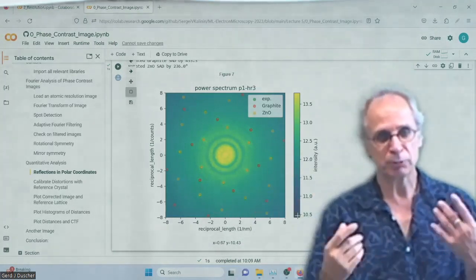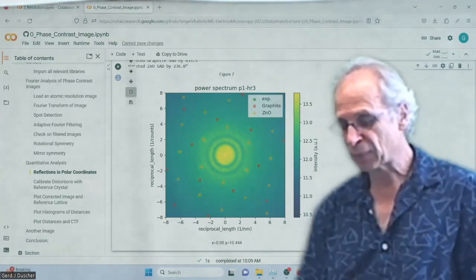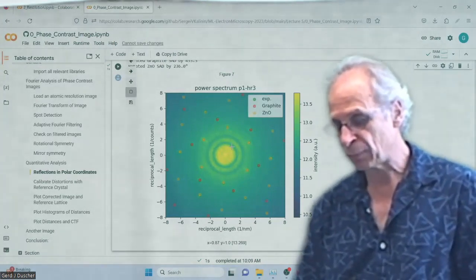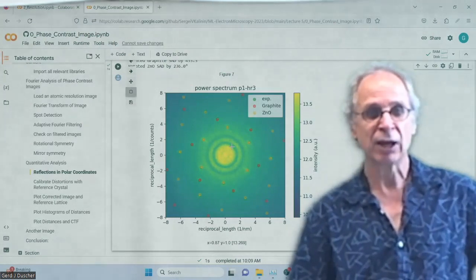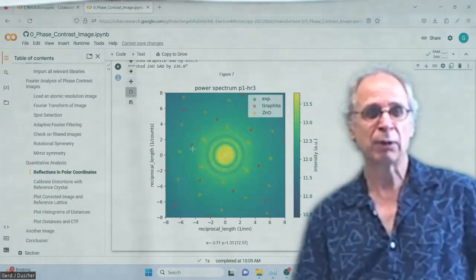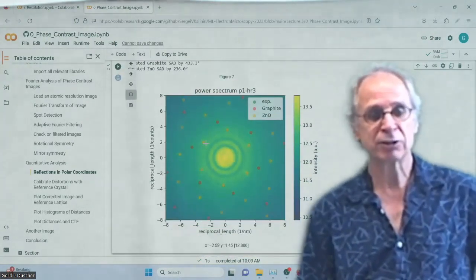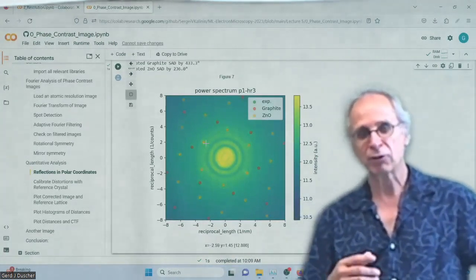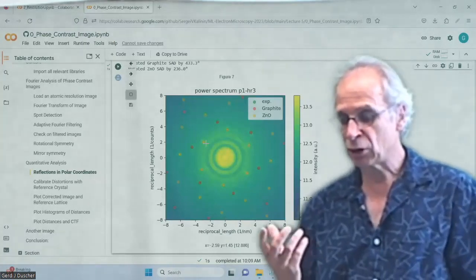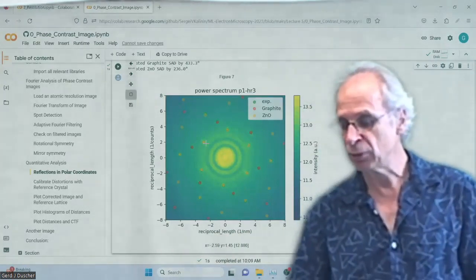Obviously, they are sixfold with 6 mm symmetry here with two mirror planes, two different materials. But together, they didn't have that. They have no epitaxial relationships that we can see. And so now we have actually discriminated the different spots by their crystallography. So now we can look at only the zinc oxide, only the graphite if we want to.